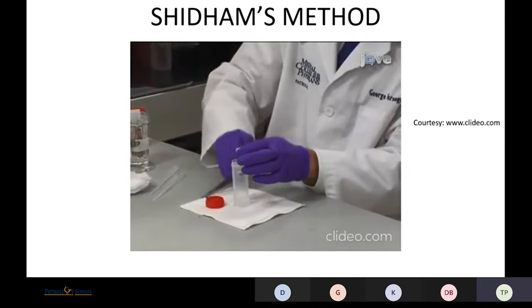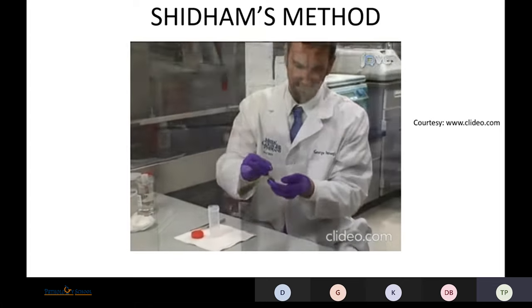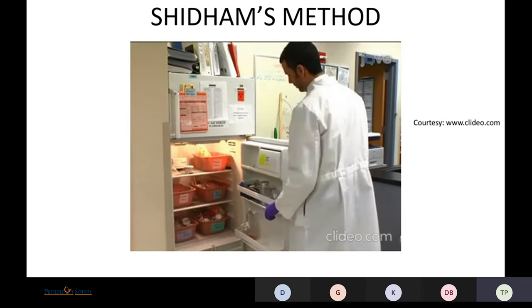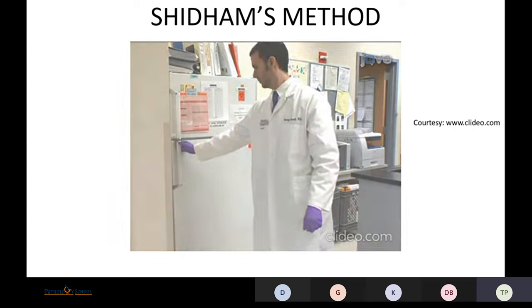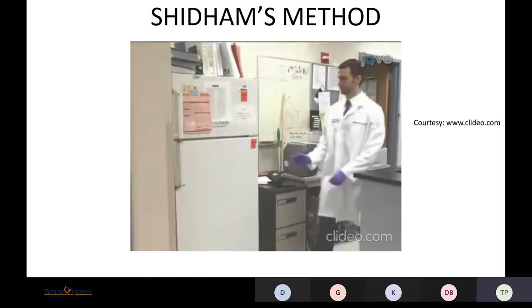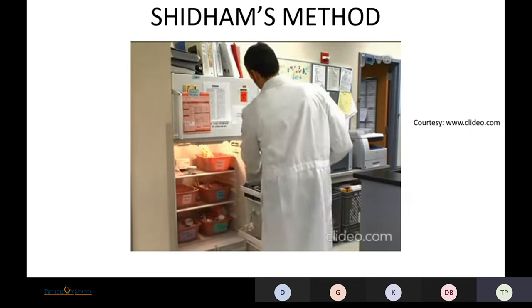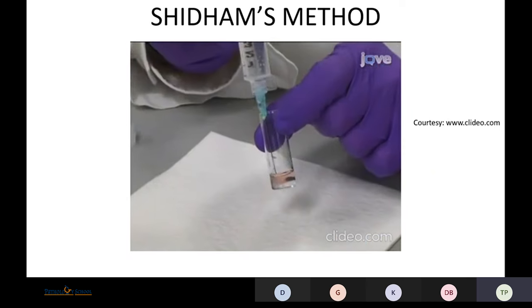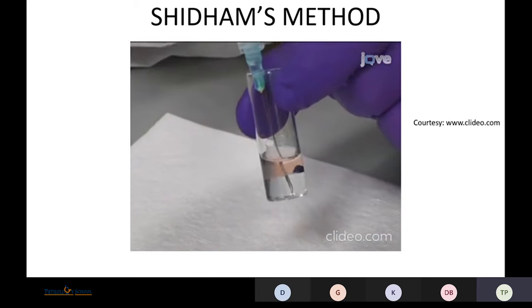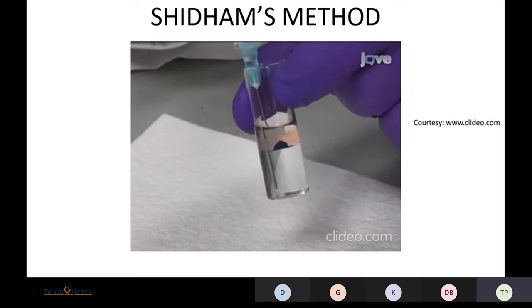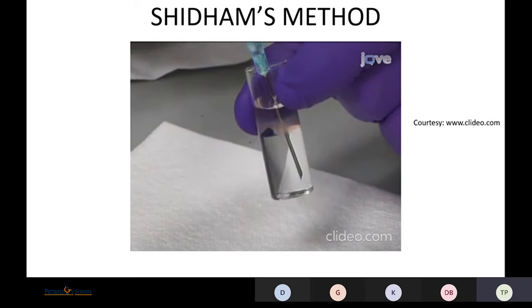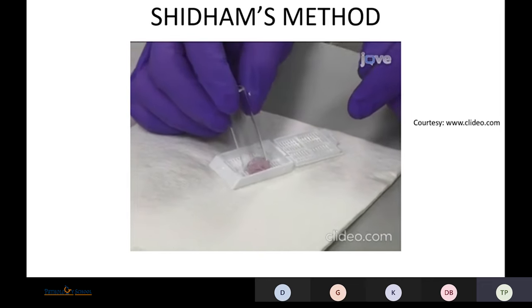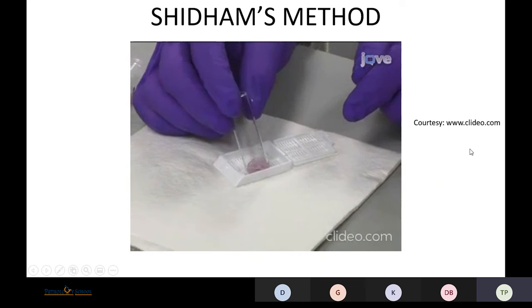Using forceps, remove the smaller glass tube vertically without disturbing the sediment layer. Refrigerate the small glass tube in a vertical position for 15 minutes to cool and solidify the gel. At the end of 15 minutes, remove the gel containing the cells from the glass tube. To dislodge the solidified HG disc — which contains a layer of concentrated specimen and the dark-colored AV marker — use a 23-gauge needle attached to a syringe filled with 10% formalin. Insert the needle along the side of the tube at the periphery of the solidified disc, then rotate the needle while slowly pushing formalin through the syringe to separate the HG button from the flat bottom of the glass tube.